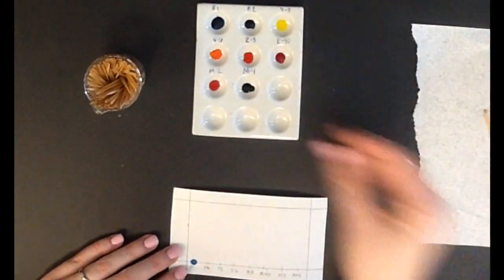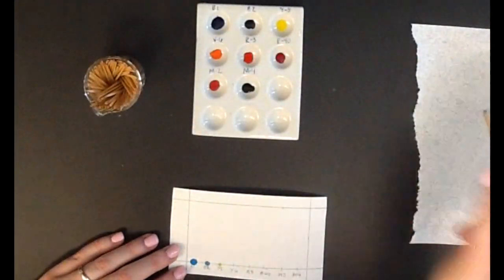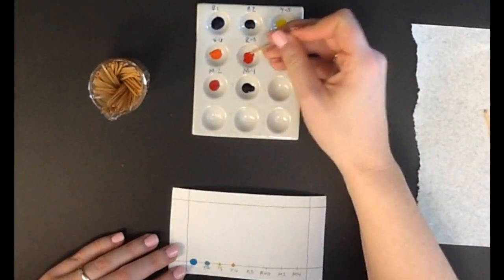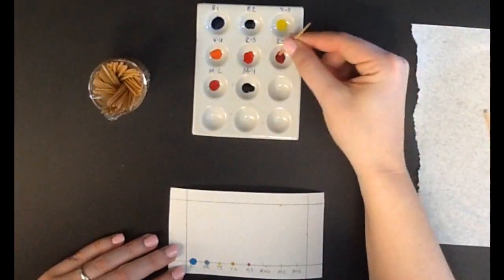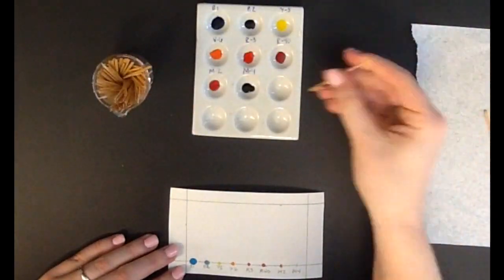Using a different toothpick for each dye, spot each dye into the corresponding spot on your chromatography paper. Once you are finished spotting, roll your paper and staple the edges together. Make sure you do not overlap the edges.